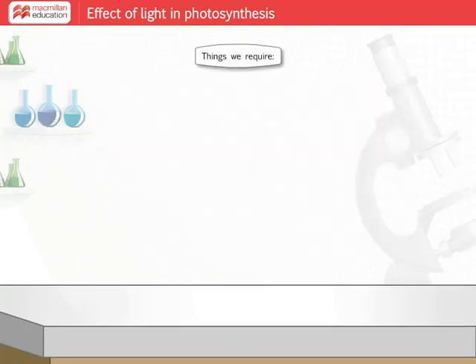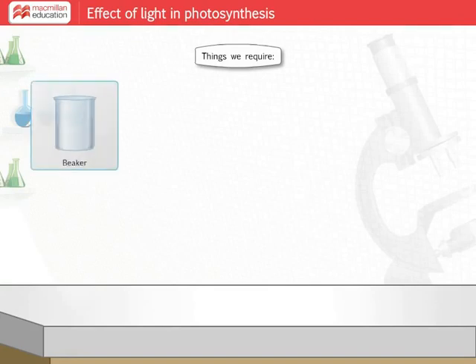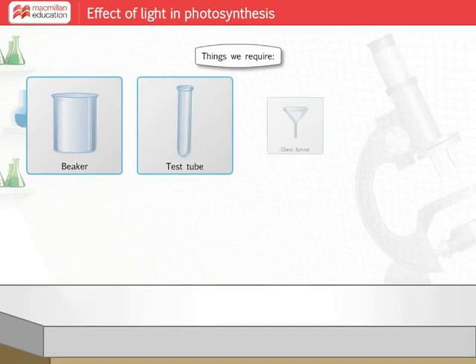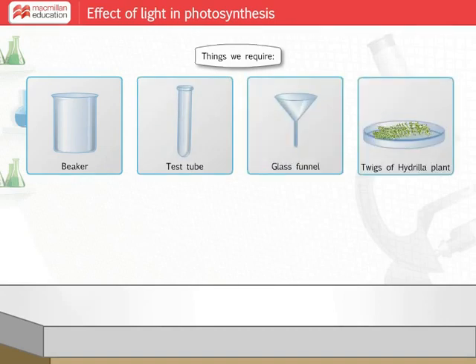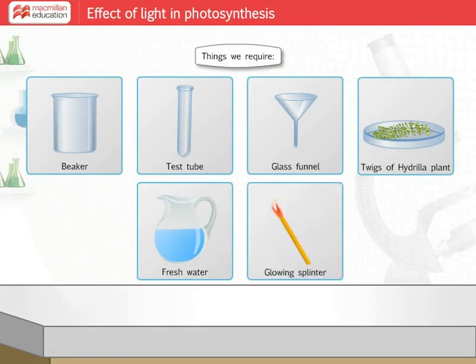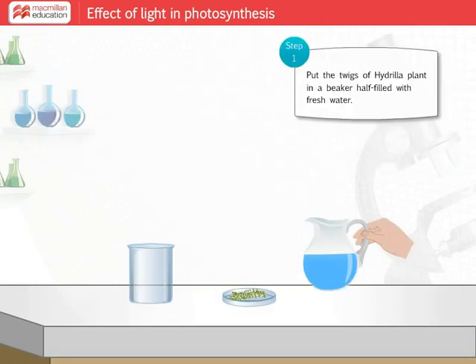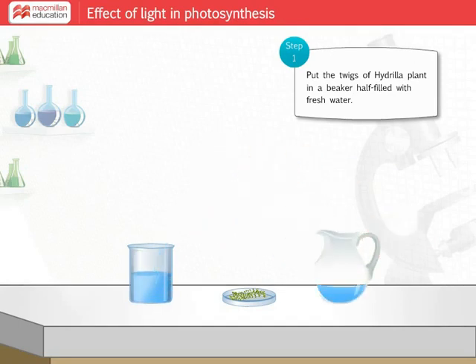The apparatus and materials you require to perform this experiment are a beaker, a test tube, a glass funnel, twigs of hydrilla plant, water, and a glowing splinter. Let's get started. Take a beaker and fill it with water.